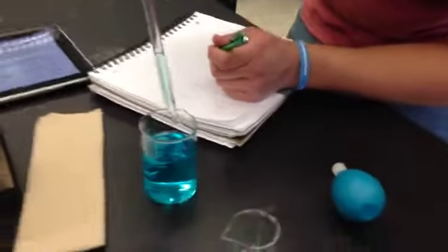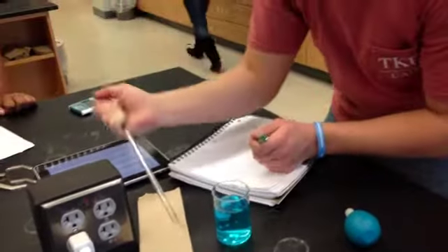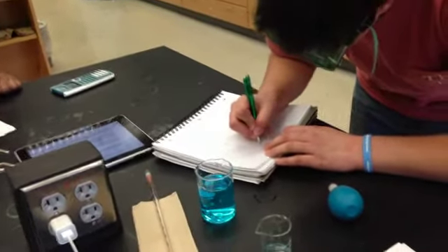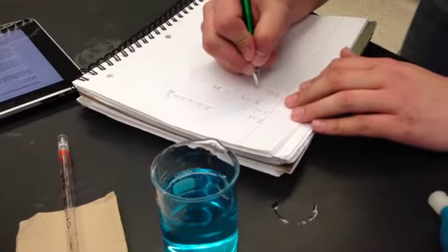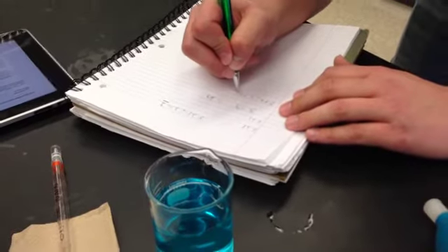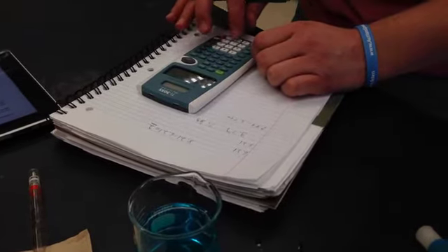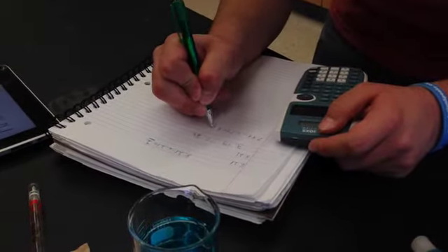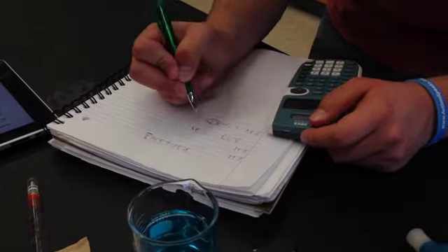Okay, so now you can release the rest of your liquid. Now the formula you're going to use is you're going to take your final volume, which was 7.89, minus your initial volume, which was 3.79, and you're going to subtract them. So you take 7.89 minus 3.79, and that gives you 4.1. So 4.1 is going to be the volume difference that you come up with.